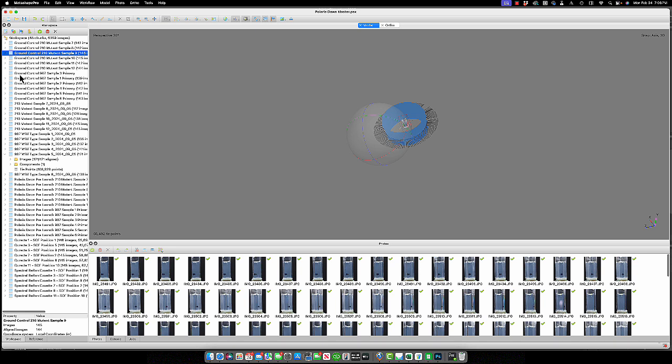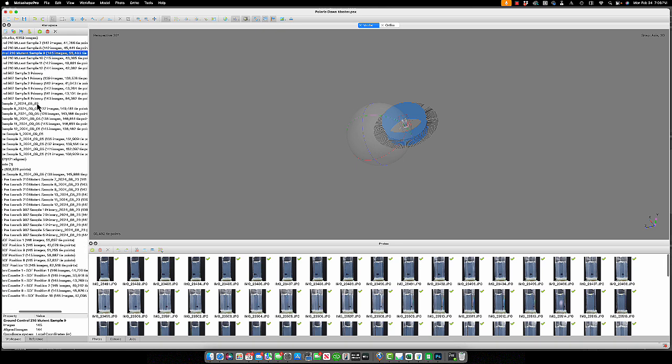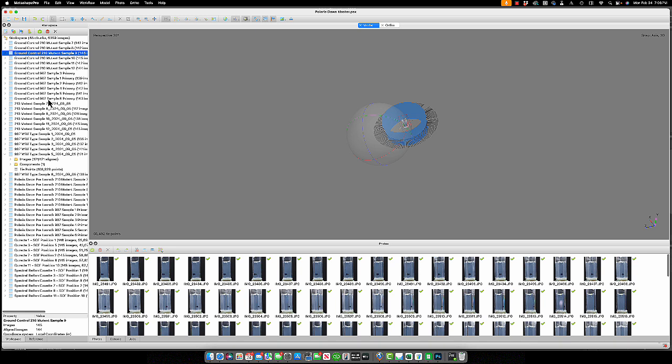When it comes to the other ones that I was having issues with, I was rerunning them, and I reran them and then had more success. So about 4 of the 7 actually came together really well, and again produced a similar result to what you see here. Now, just to recap how you would go about reprocessing all of the data.